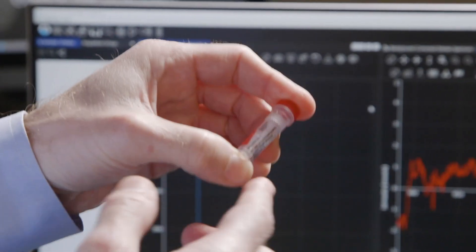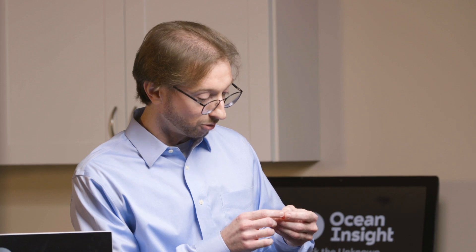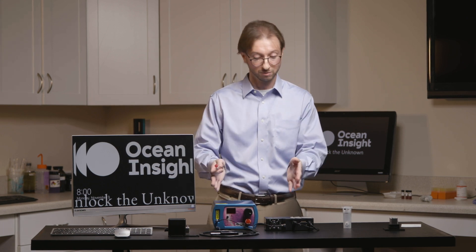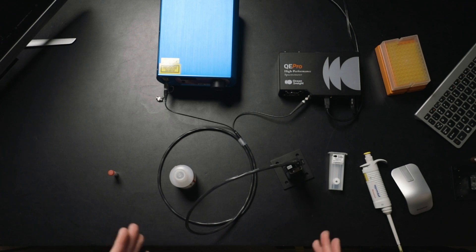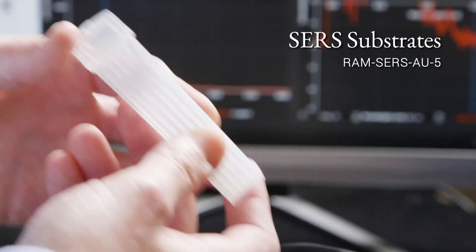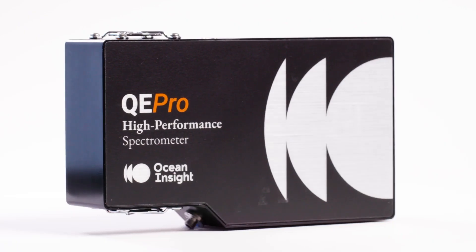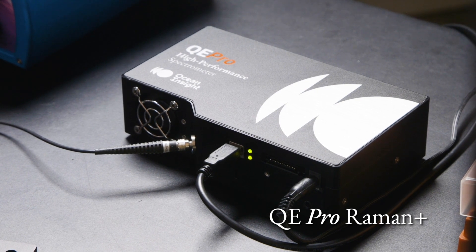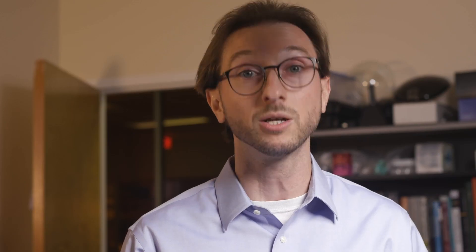What we have here are actually some antibody samples from the SARS-CoV-1-2 protein. Let's see how well we can do at detecting this using the typical Raman-SERS setup. We're using a 785 nanometer Raman setup tuned for our SERS substrates, which use gold nanoparticles embedded into a proprietary quartz matrix. They're very low cost, consumable, and very powerful in their ability to bring up Raman signals that are otherwise completely undetectable. The spectrometer we're using is the QE Pro high performance spectrometer — a high resolution instrument with very good sensitivity for low light scenarios such as Raman emissions, which are very low probability types of emissions.